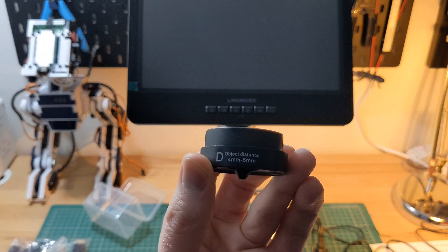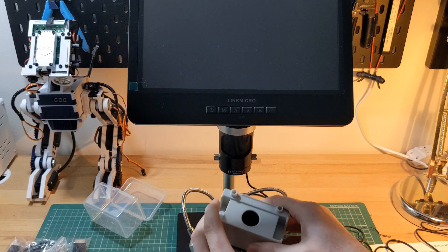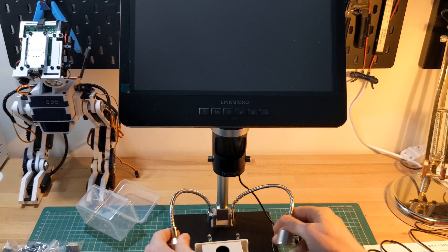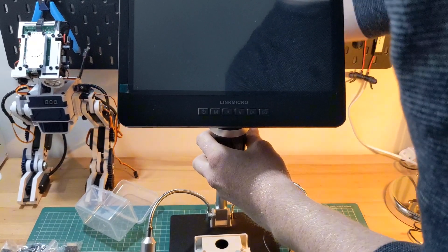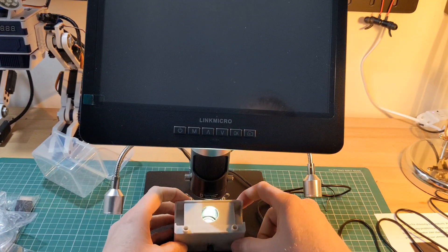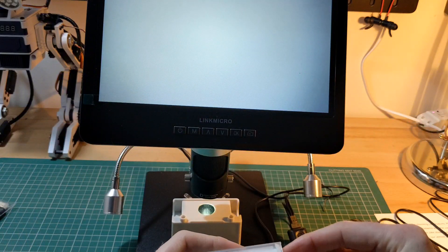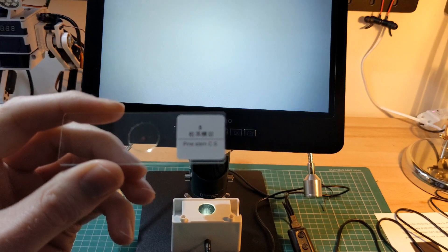The 2040x magnification lens is significantly more powerful and suitable for viewing slides and other small objects. The microscope comes with a slide mount that can be used to hold the slides in place and has a built-in light source. The focus range is very close, so it takes a little while to adjust the microscope as needed. Here I'm using one of the example slides included with the microscope to test, but you can easily create your own slides to view.